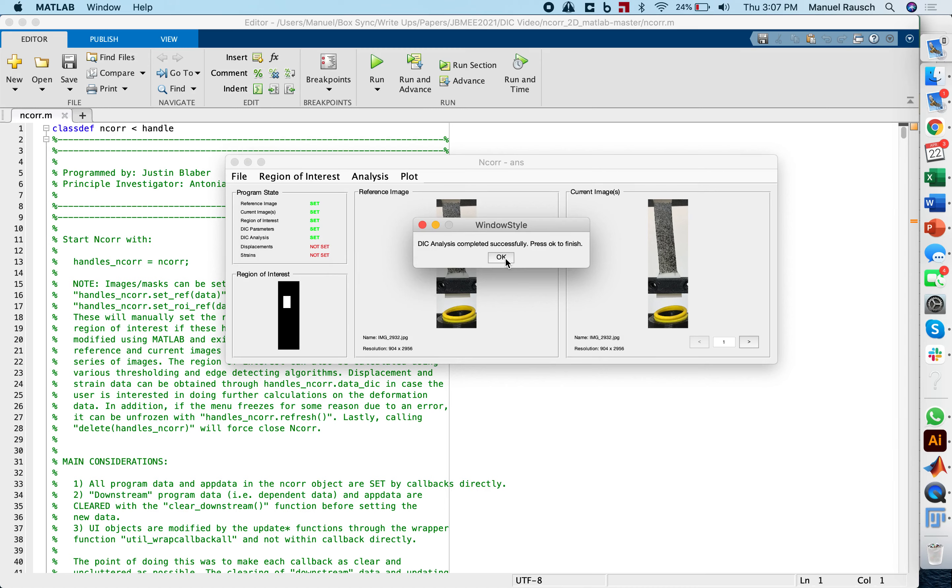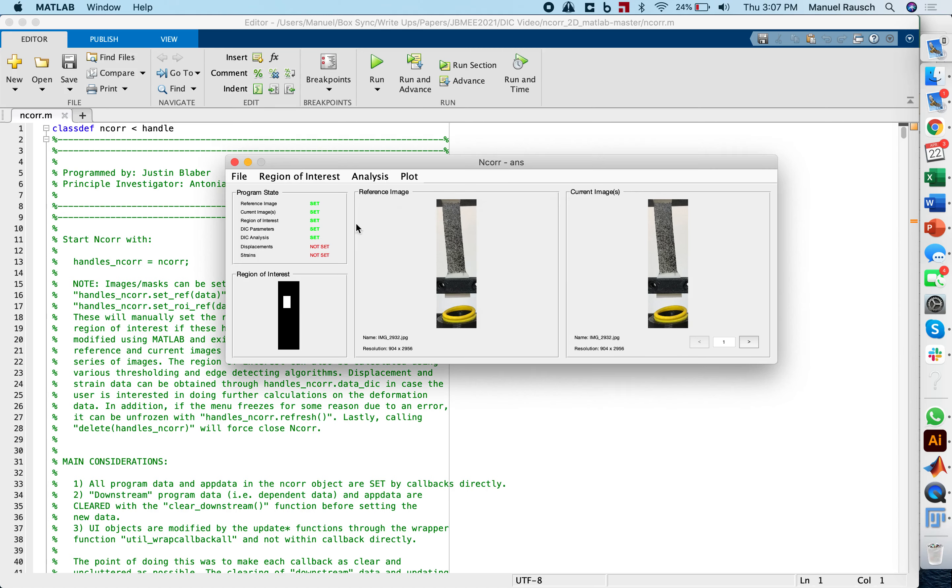We're back here. I cut out the tedious part between image three and 14. The DIC analysis now completed successfully and we press OK to finish. And if you look at the list here, we see the DIC analysis now green.